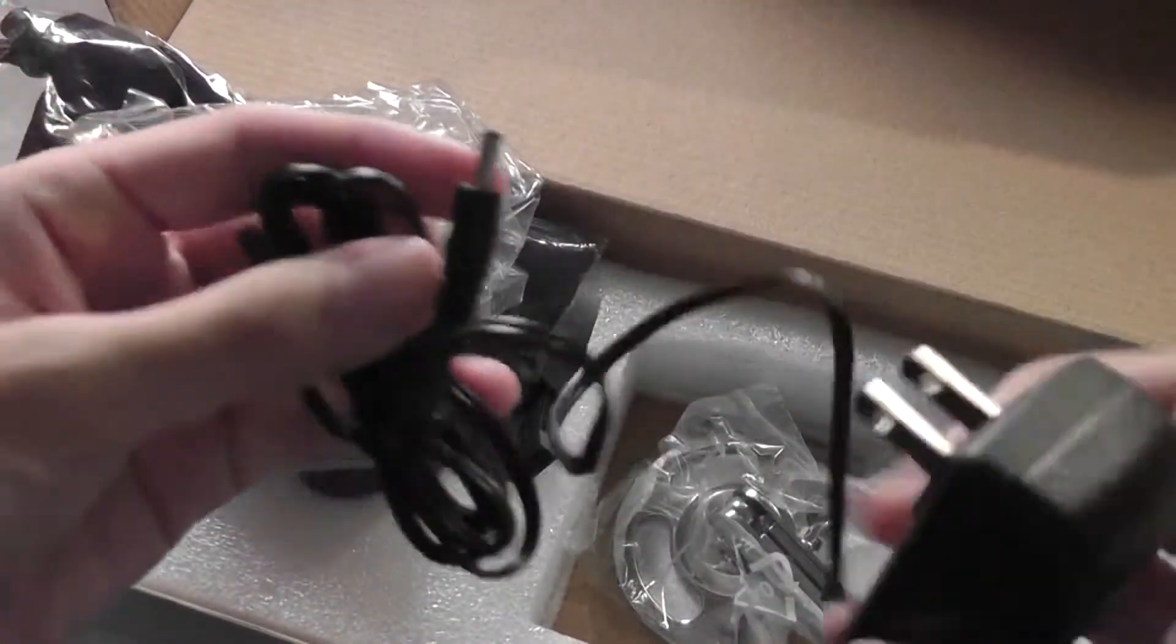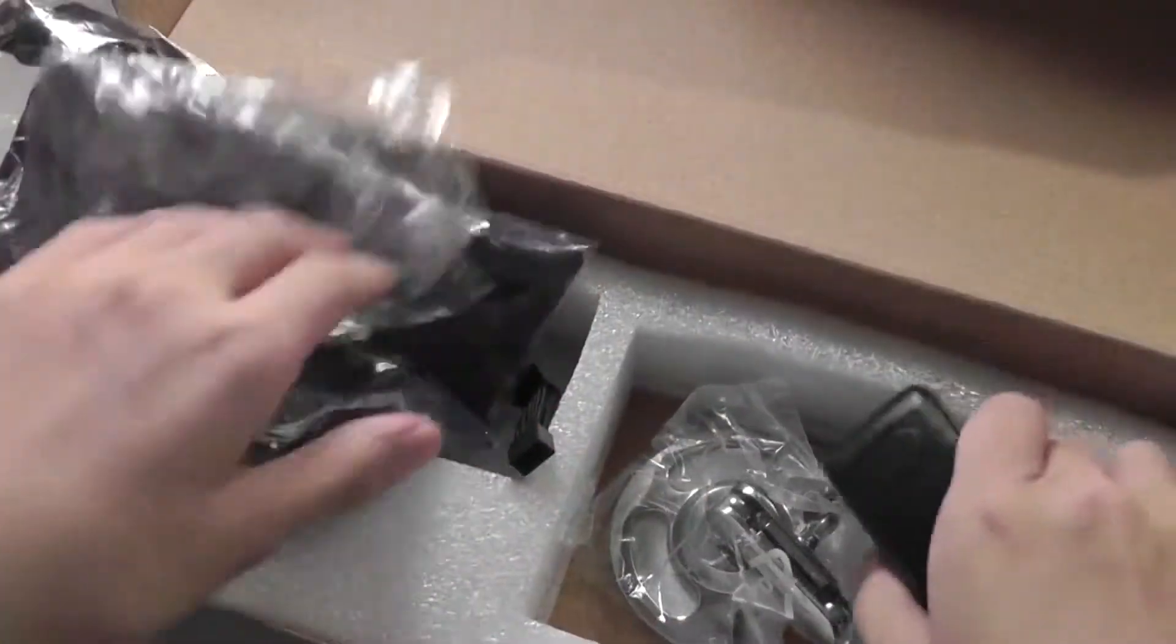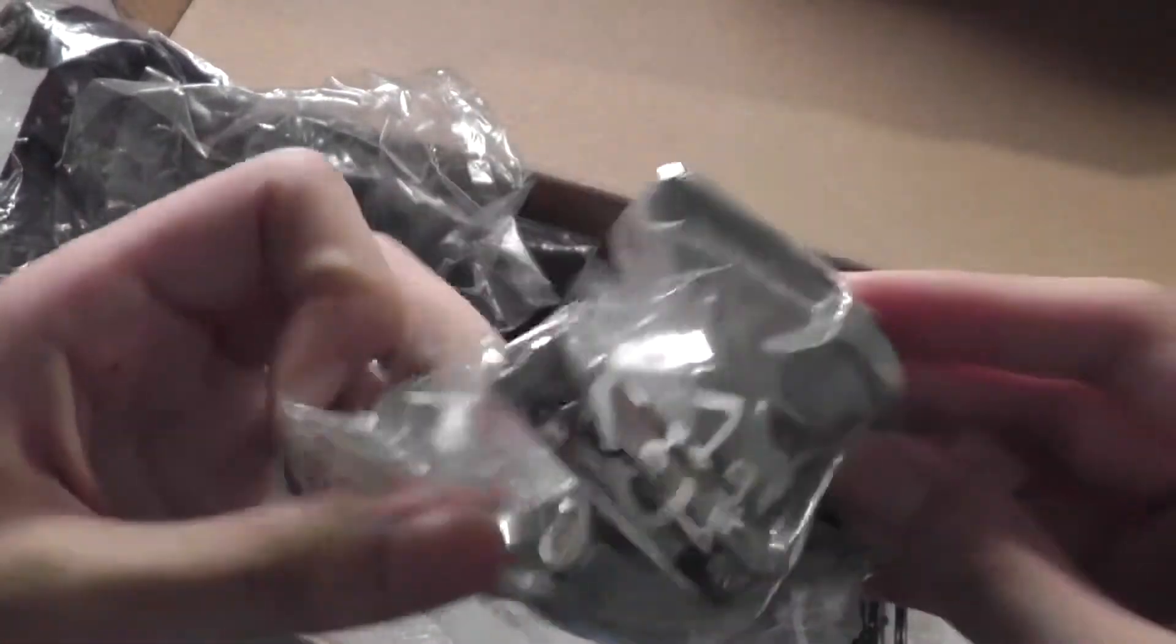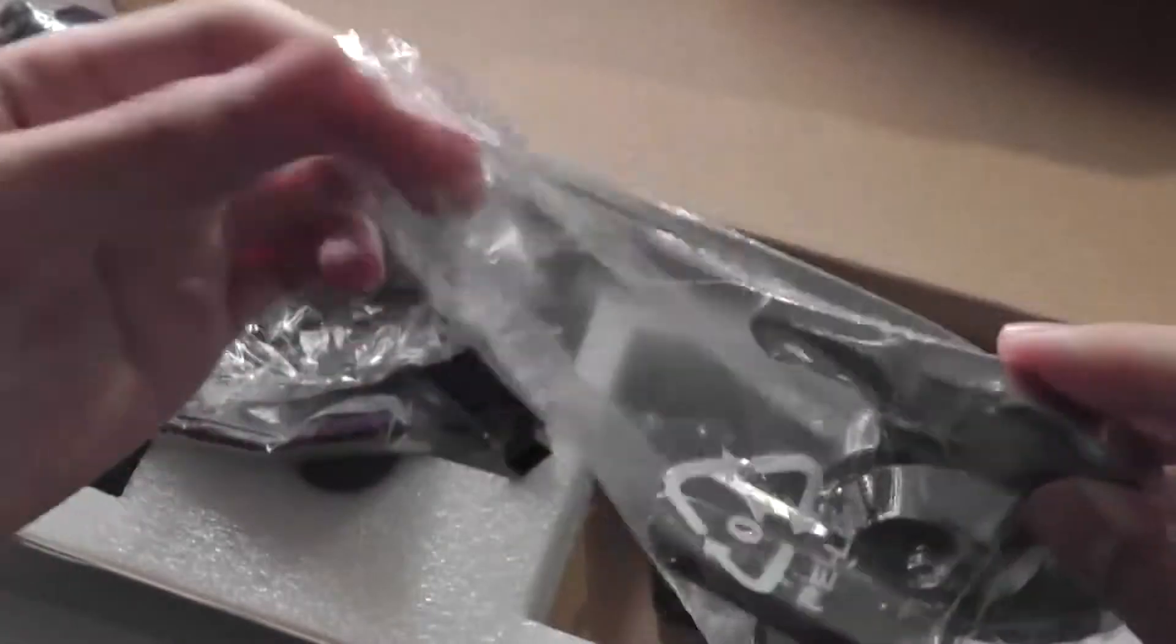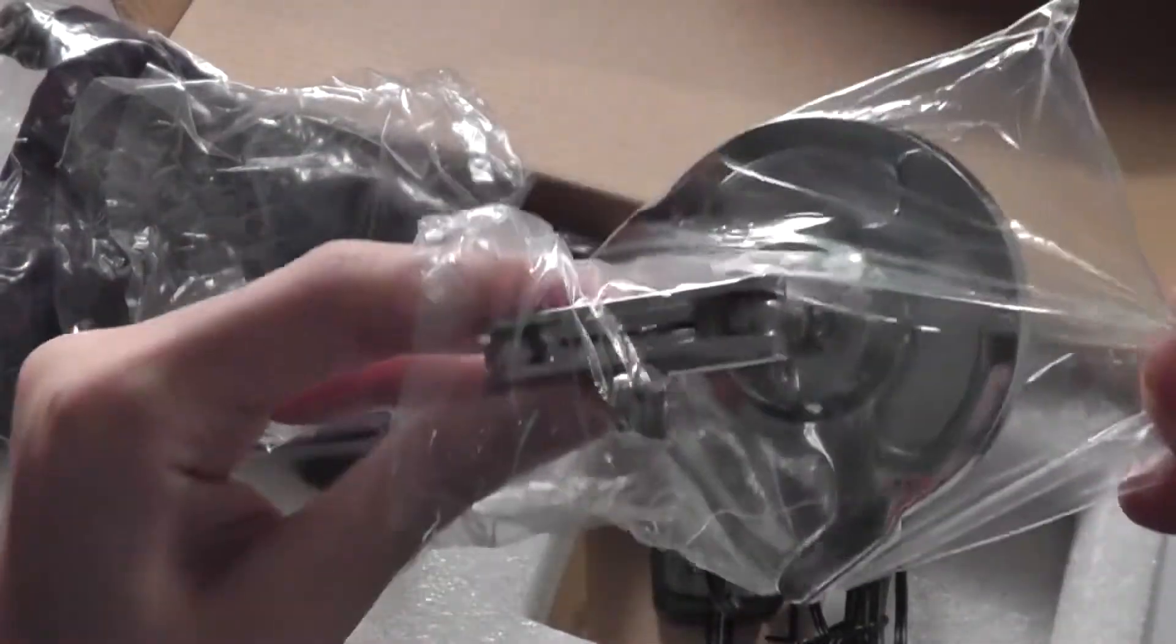There is the AC adapter, which you must use to charge the device. It's a proprietary charger, not a standard one. And finally, there is the case or the stand, which allows you to have the device mounted when you're not using it with your hands. This is the traditional stand to transform the digital microscope into a more old-fashioned one.